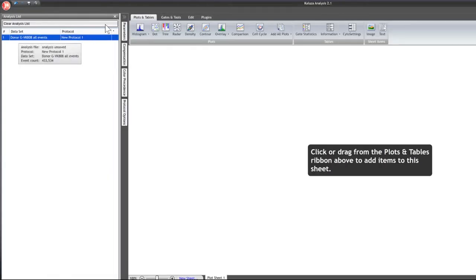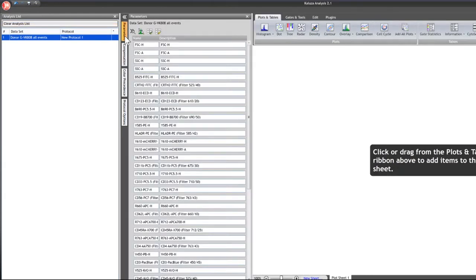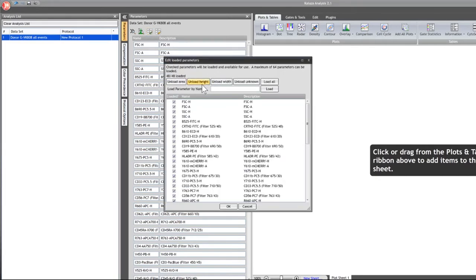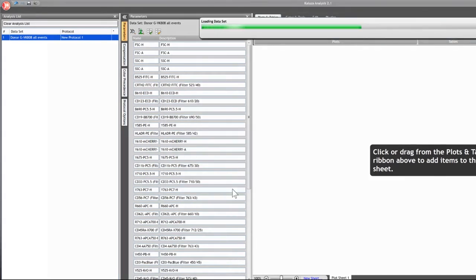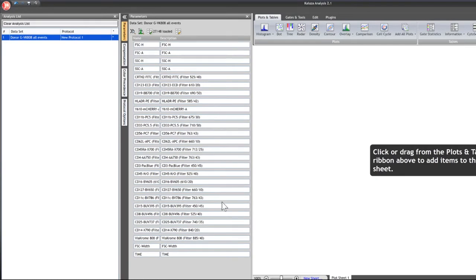Once the data file is loaded, click on the parameters tab, and this will open up all of the names and descriptions of your different parameters within the data file. You can come in and adjust the names and descriptions of the parameters if needed. You can also edit the loaded parameters — for example, if you want to unload all of your height parameters, you can do so, and then reselect any height parameters you'd want to load. When you click OK, it adjusts which parameters are loaded within the Clusa analysis.